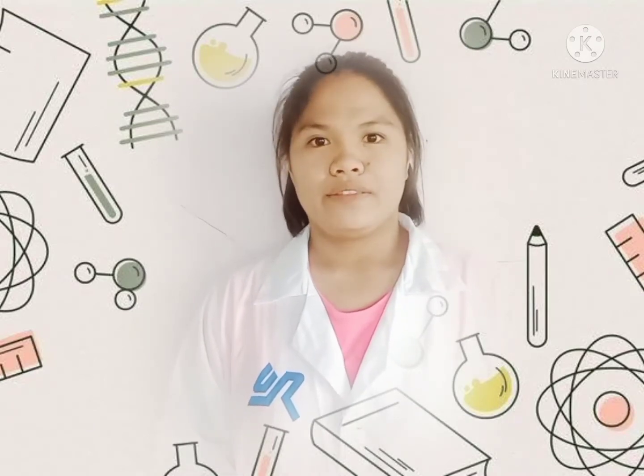External parts of a chicken. Beak. It serves 3 functions. First, it is the chicken's mouth. Second, it is used for fighting and protection. And the third one, it functions as the teeth of the chicken, enabling the bird to break grass, fruit, and other food into small pieces small enough to swallow.